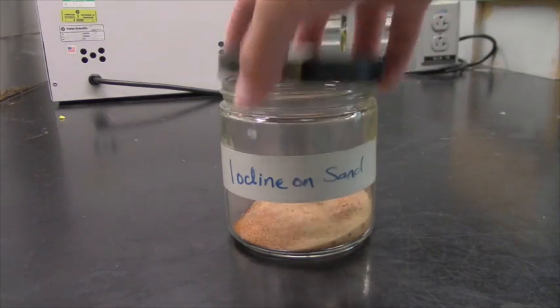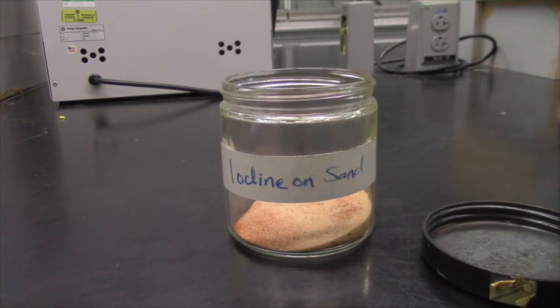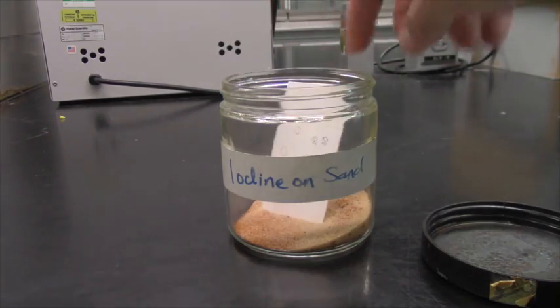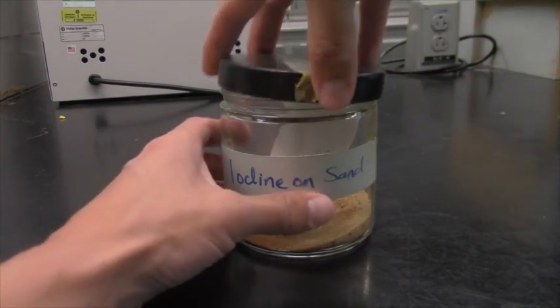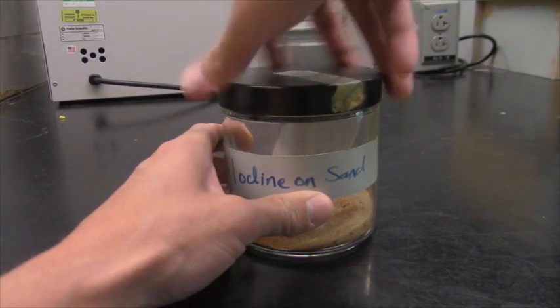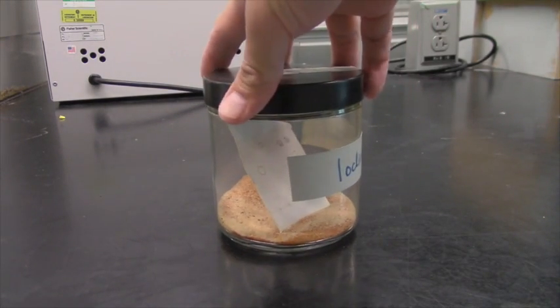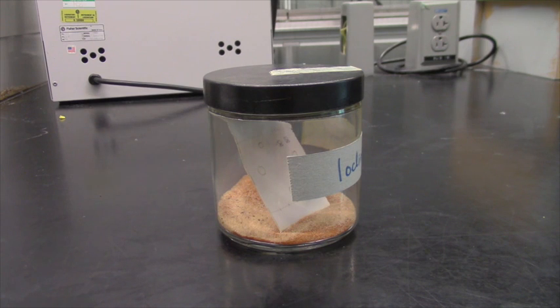The second visualization method that you can use to see the spots on your TLC plate is simply staining with iodine. So here what I'm showing you is basically we're just going to put the TLC plate into this jar that's got iodine mixed with sand. The iodine vapors will stain your spots so that you will have a permanent record on the TLC plate. Make sure to do this step after you've done the normal UV visualization method.